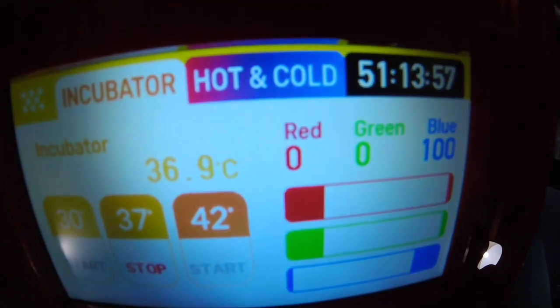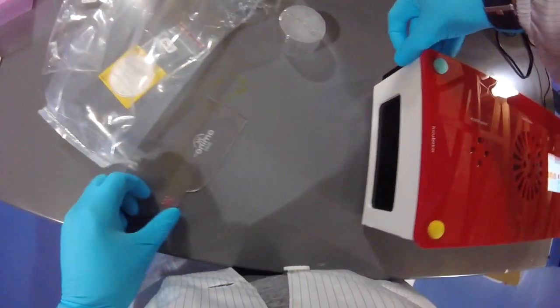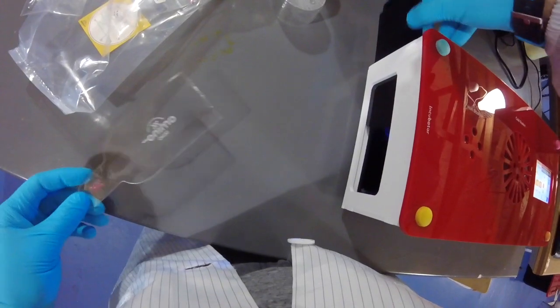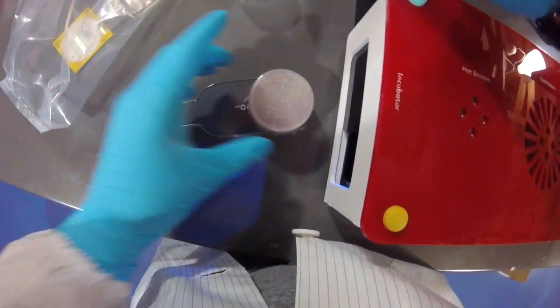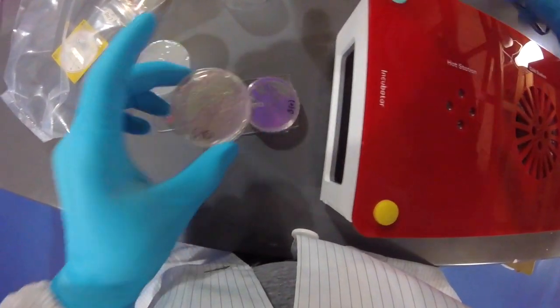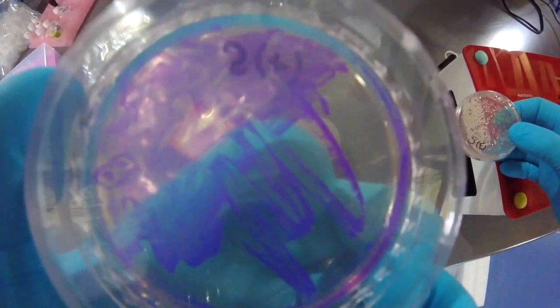Hello, so it has been 51 hours and 13 minutes since the plates with the recovered cells were incubated. So I'm just going to open it up here. We looked at the cells at roughly 24 hours. Let's see what this looks like now. There we go. Look at that. You can see the positive control purple cells are way more purple than they were before.